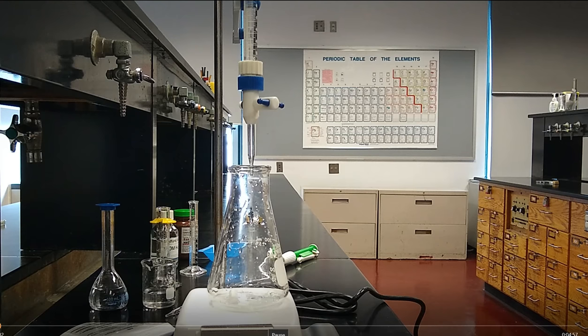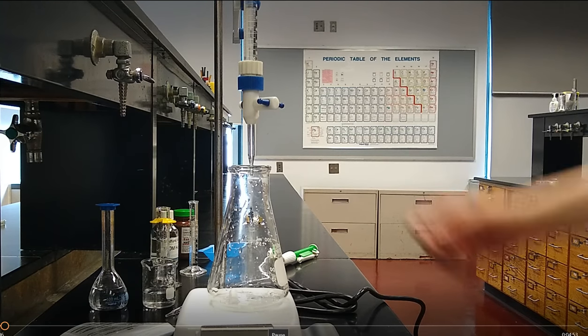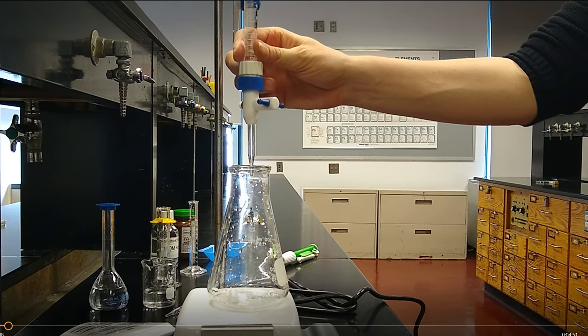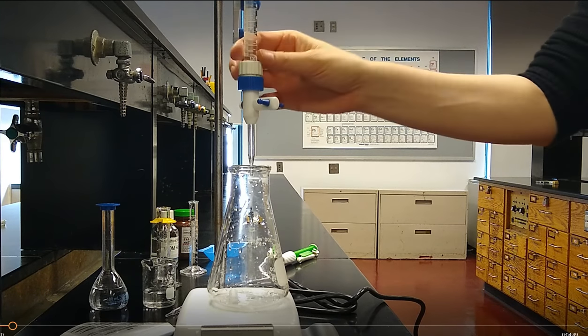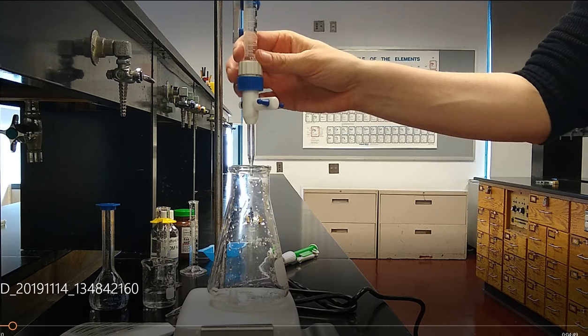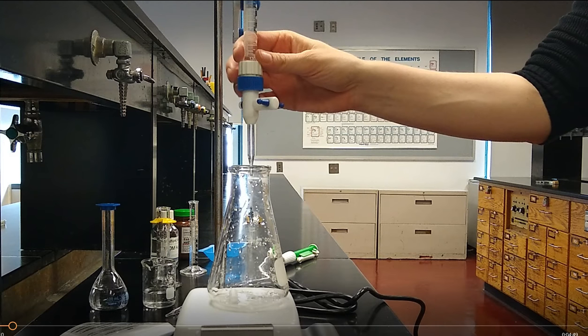Let's start by reviewing the equipment you're going to need. In your lab manual for question one, you've got two pieces of glassware. The long skinny tube labeled number one is the burette. We use burettes because they allow us to measure and deliver extremely precise and accurate volumes of solution. That's a big part of this lab - being able to know exactly how much solution was added.